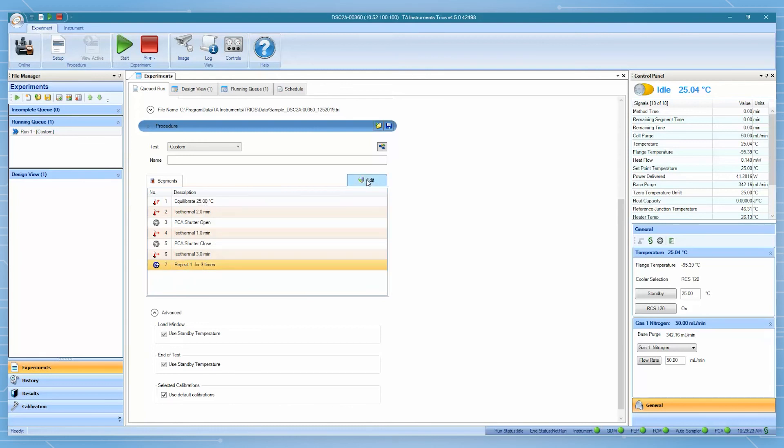If running the PCA experiment with an RCS, loading and unloading samples should always be done when the cell has reached ambient temperature or above to avoid condensation. Choose the end of test condition slightly above room temperature.